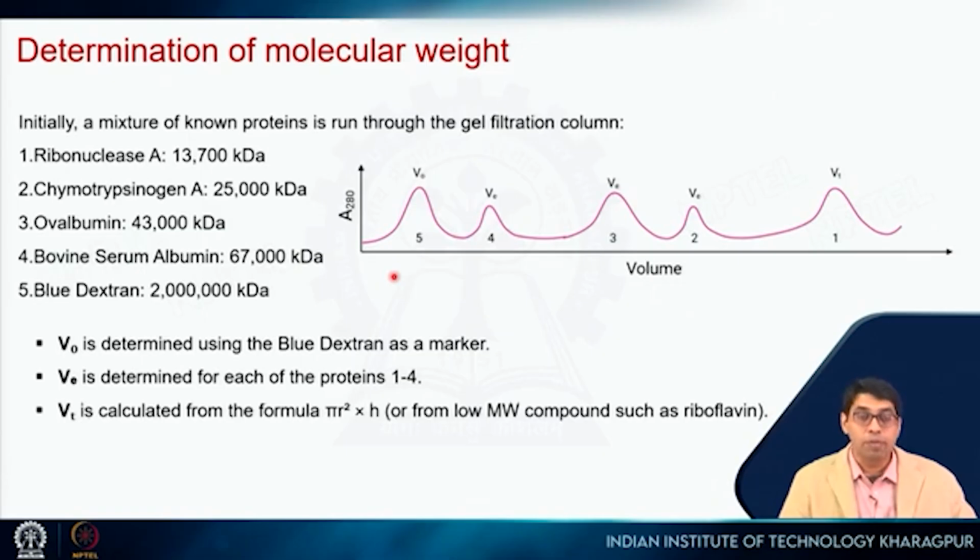Once we have done that, we have done our separation. But this technique not only gives you a more pure protein, but it can also tell you what is the molecular mass of your protein, approximately, right? So how do we do that?